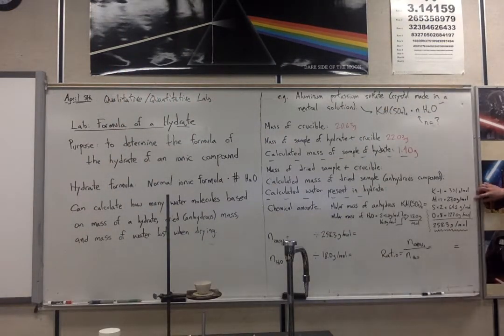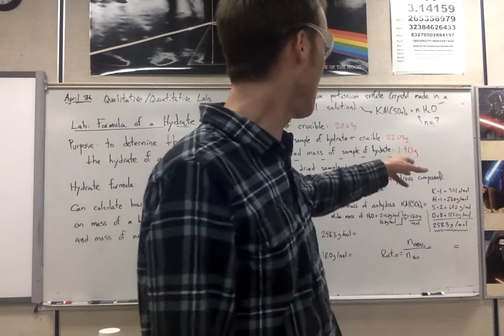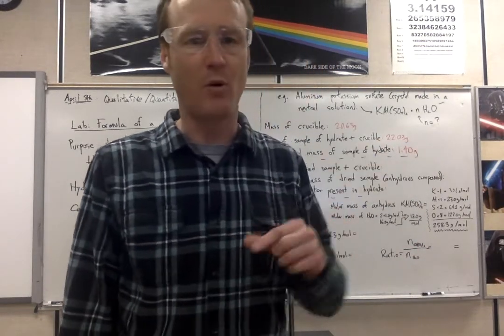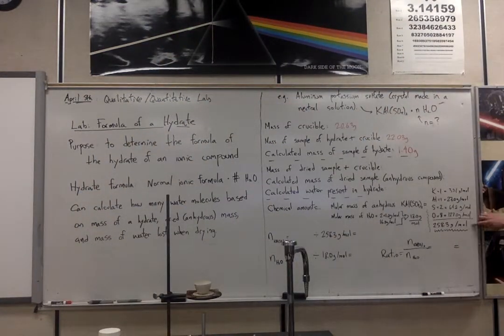1 aluminum at 27 grams per mole for aluminum. We get 32.1 times 2 is 64.2. Oxygen is 8 oxygens times 16 grams per mole gives us 128 grams per mole. All of these add up to 258.3 grams per mole.